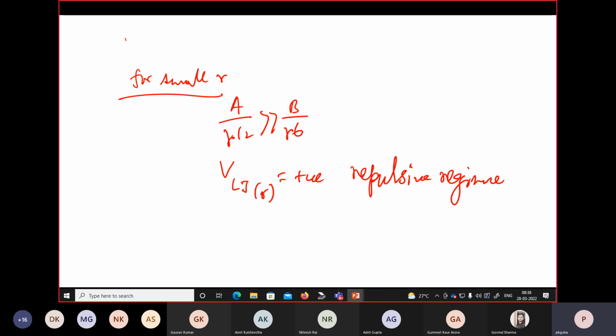And all we are detecting is that deflection. So there are different techniques over the years people adopted. Let me mention some of them. So all we are doing, we are basically detecting the deflection of the tip when it is moving over the nanomaterial surface.